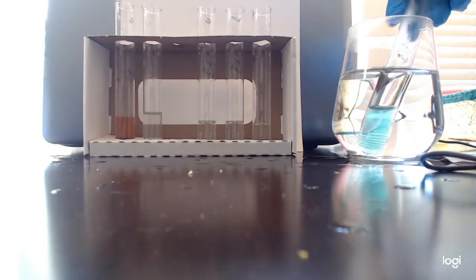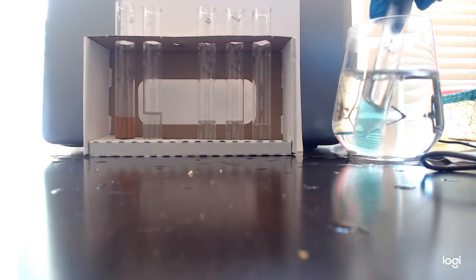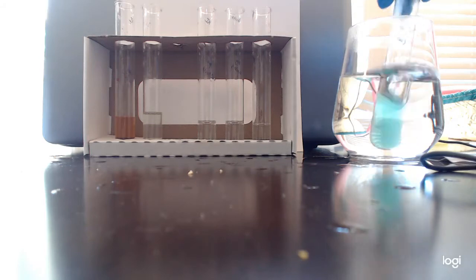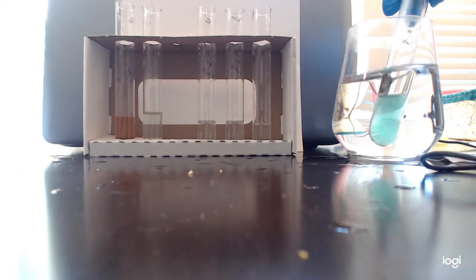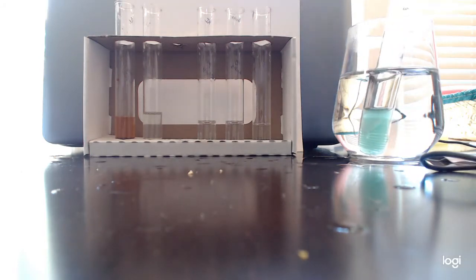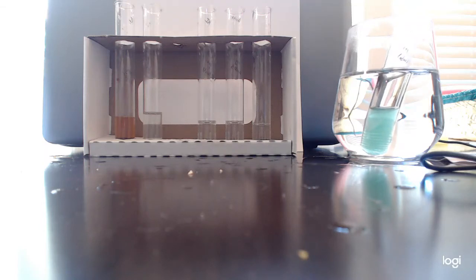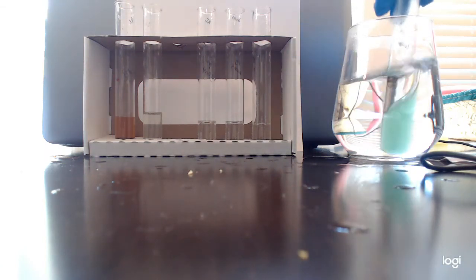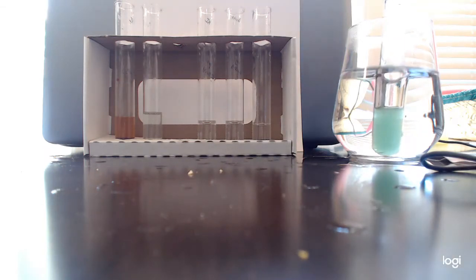You can see it's kind of getting greeny, opaque-y. And the cool thing about this experiment is that not only does it change color, but the reaction also does something called precipitation. If you're familiar with that term from weather, precipitation of water, that's when water vapor becomes liquid water. Aha! So that idea of something becoming solid or reappearing is really what is behind that idea of precipitation.